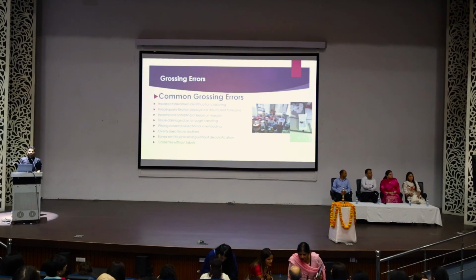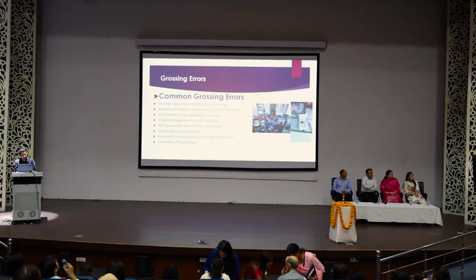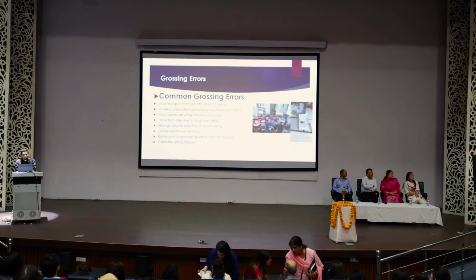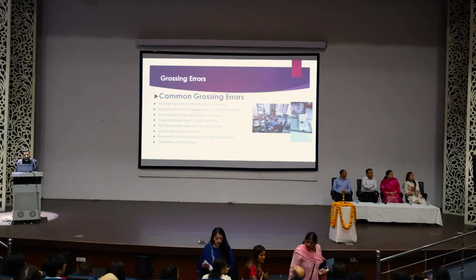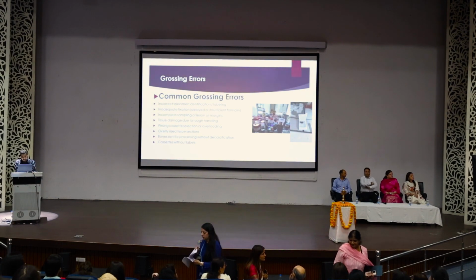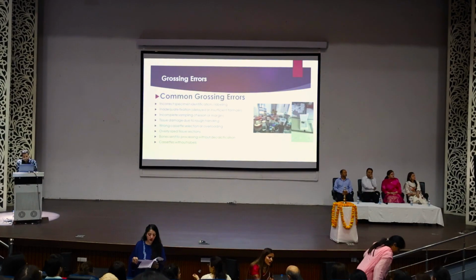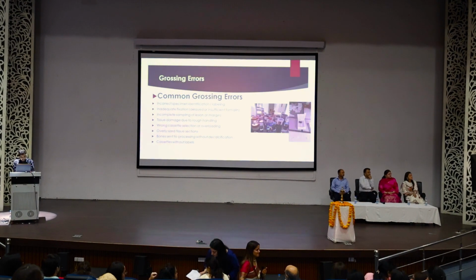As we have color-coded cassettes in our labs, you need to be sure which color to use for which tissue. And also you need to be sure to not overfill the tissue, especially in resected prostate. We sometimes find a cassette that is very, very overloaded. Sometimes if the cassette opens in the processing, we may lose all the tissue pieces.